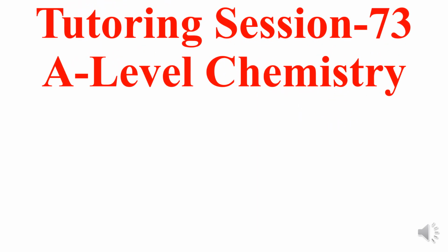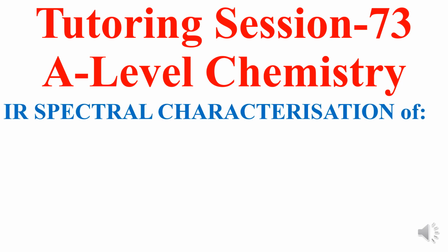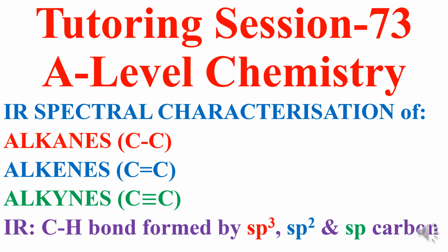Welcome to my 73rd tutoring session in A-level chemistry. In this video, I'll explain the IR spectral characterization of alkanes, alkenes, and alkynes. Later in the video, I will discuss the IR spectral peaks of CH bonds formed by sp3, sp2, and sp hybridized carbon.